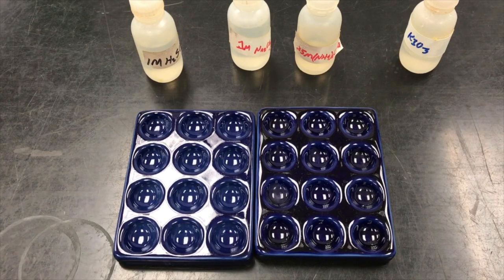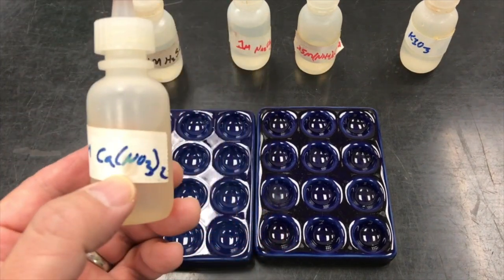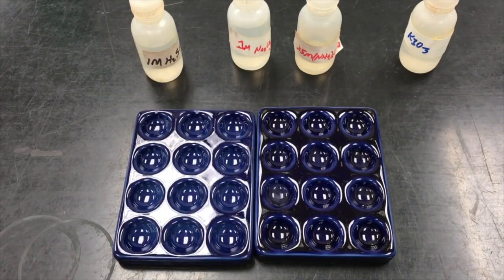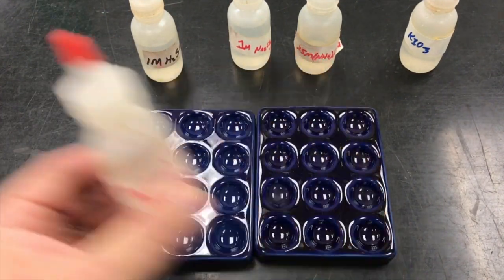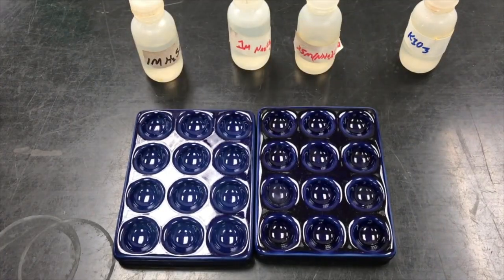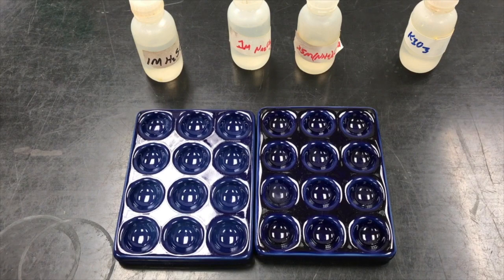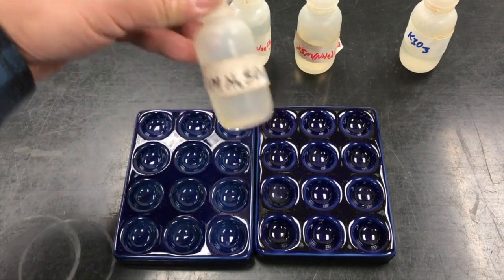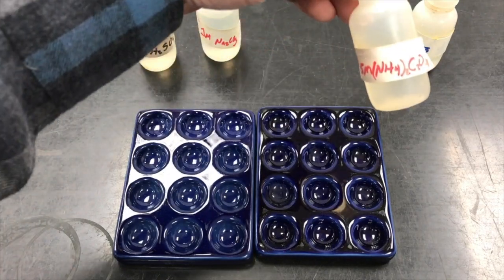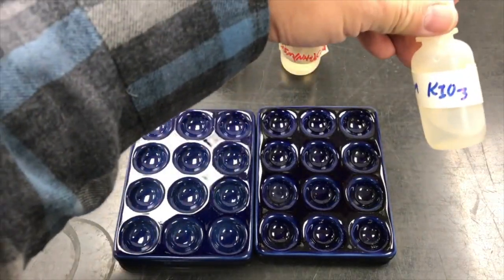We are going to take nitrate salts of the earth metals like calcium nitrate, strontium nitrate, magnesium nitrate, and barium nitrate. And we are going to see if they precipitate with sulfuric acid, sodium carbonate, ammonium oxalate, and potassium iodate.